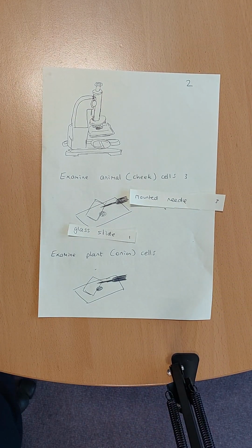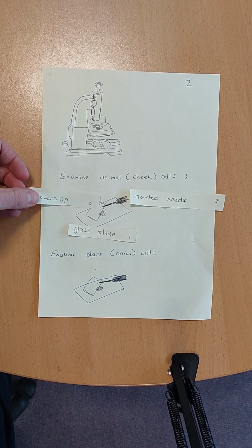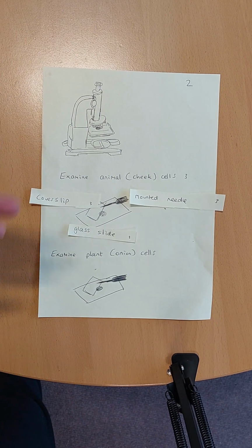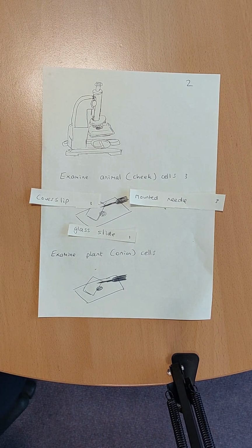And then lastly, both have a cover slip. The cover slip is the thing we put over whatever it is we're trying to magnify. You can see it's the same for both of them. So you should be able to label those three, whether you're looking at a cheek cell or an onion cell. So let's have a look at the animal cell first of all, the cheek cell.